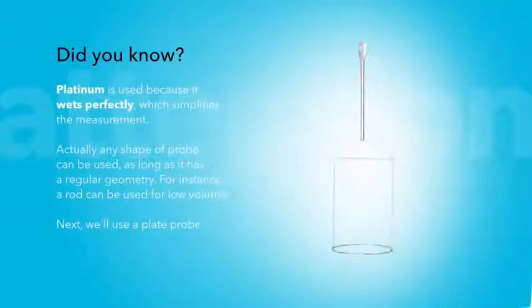Platinum is used because it wets perfectly, which simplifies the measurement. Actually, any shape of probe can be used as long as it has a regular geometry. For instance, a rod can be used for low volume. Next, we'll use a plate probe.